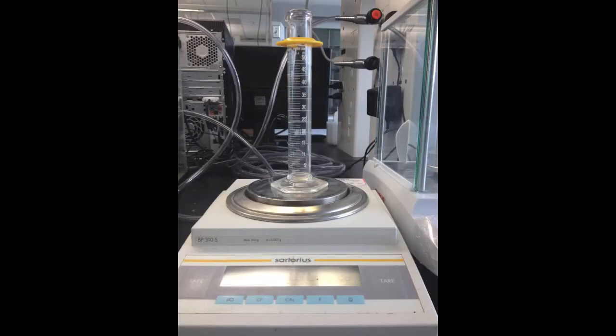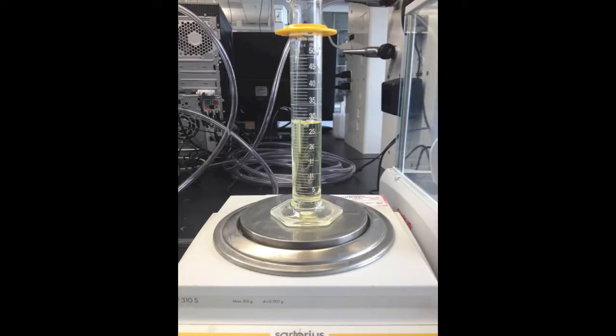Next, use a graduated cylinder to find the mass and volume of your product. To do this, place a graduated cylinder on a scale and zero the scale. Pour your product into the graduated cylinder and place it back on the scale. The mass displayed on the scale is the mass of your product. You can use this value to calculate your percentage yield.